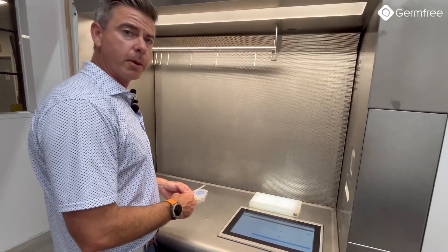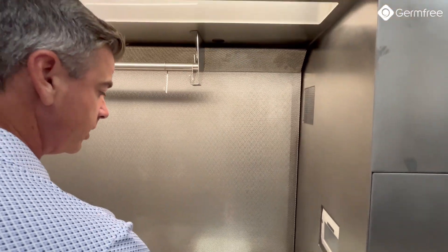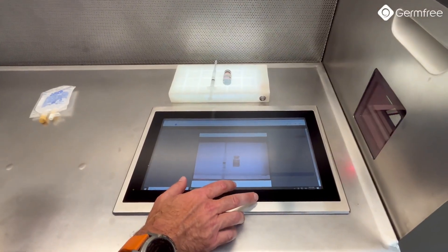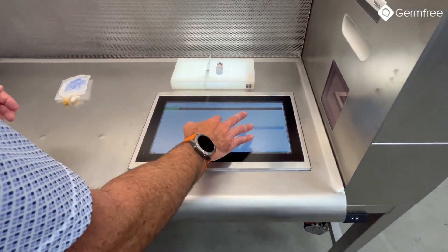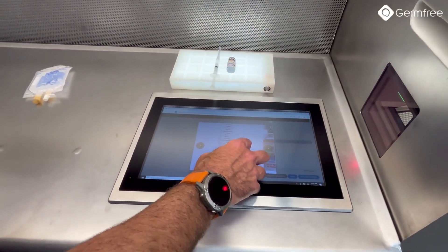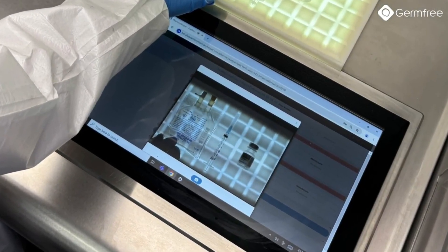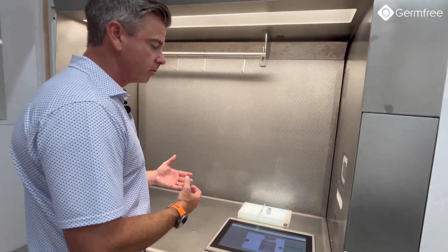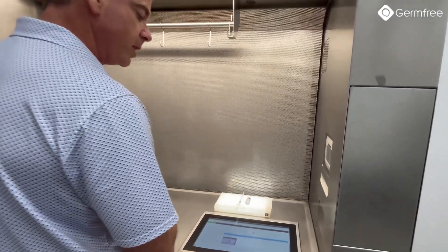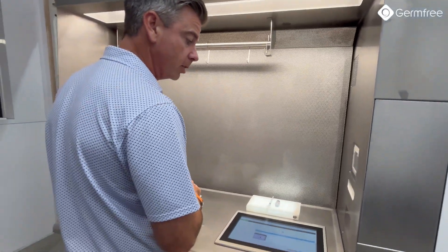Once I've completed my preparation, I can actually use the built-in light plate and built-in preparation camera to take photos and capture them. What you'll see are the images we're actually capturing with that backlit photo tray — crystal clear images of the syringe, bubbles, as well as the plunger position. You can even read the vial very clearly. I can take as many photos as I want from the preparation camera or from the field of view camera that captures the entire hood.